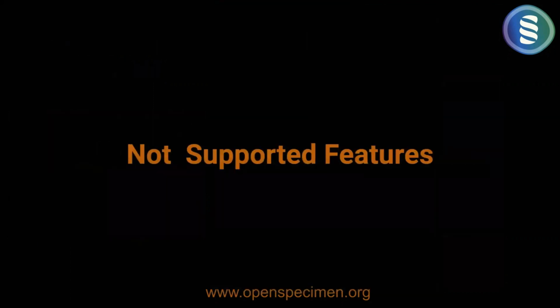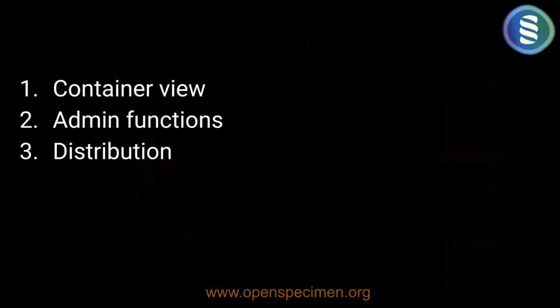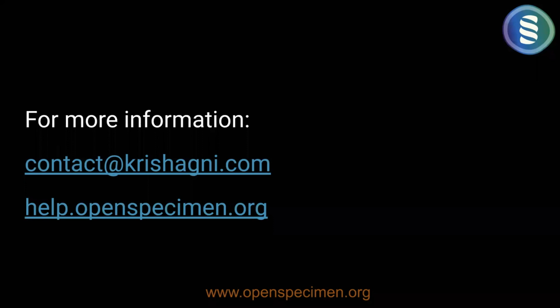Some of the things that are not supported today are, as I said, container administrative functions, distribution of specimens, request distribution, etc., and also reporting and those kinds of things. So that's about it for what I wanted to show.